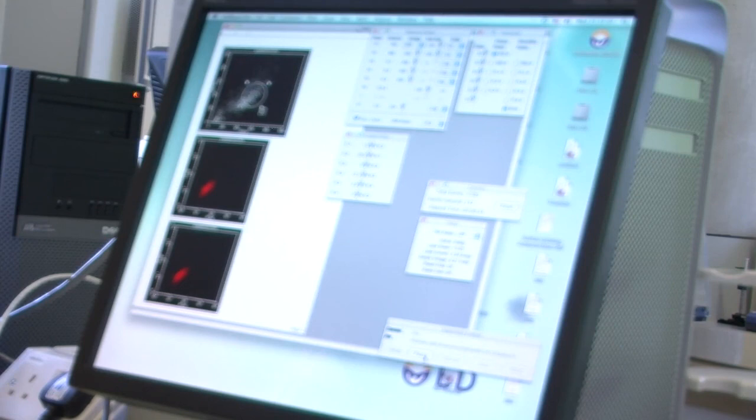So they did different techniques to characterize the cell line. So we will be doing two techniques. We'll be doing this one and we'll be doing the immunofluorescence later. And now we combine both and we explore to characterize the cell lines, because we will visualize also the cells growing in the previous image as in the cell culture.